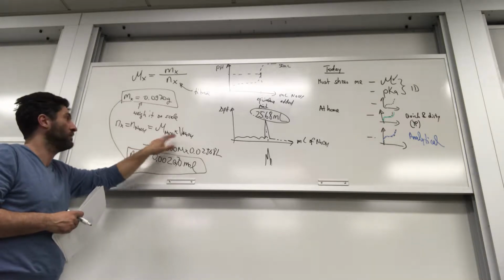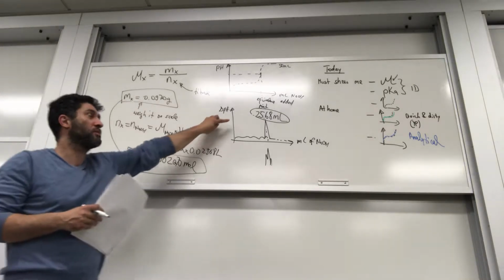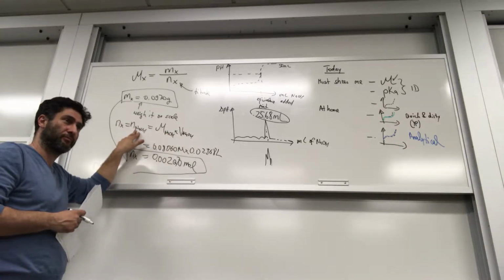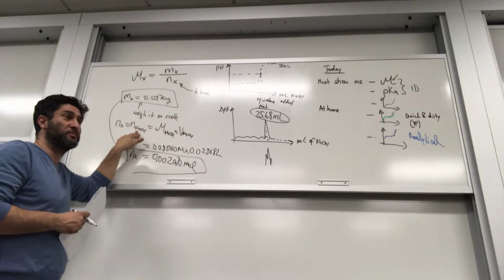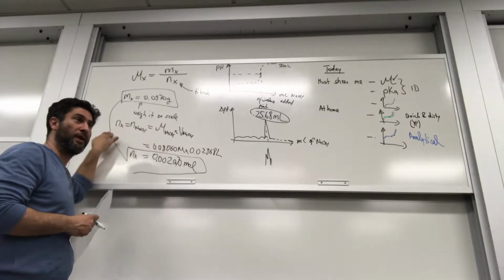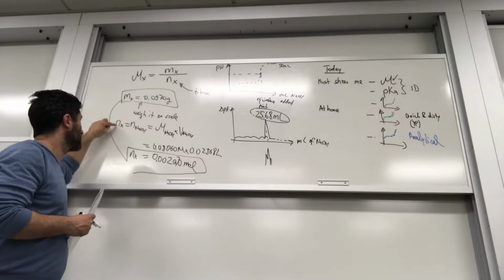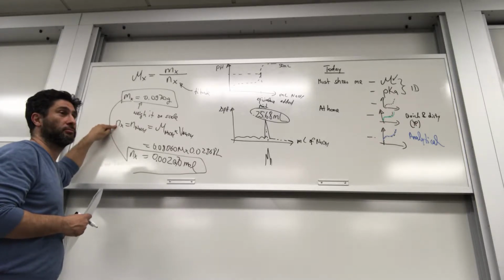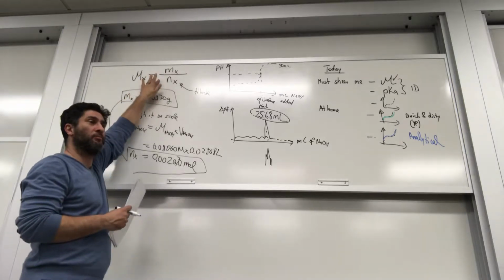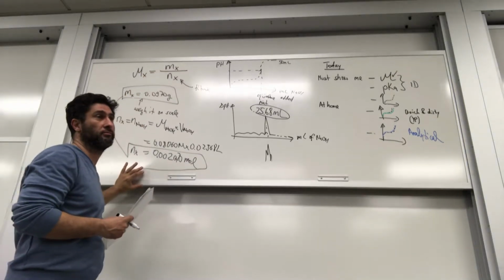You put a label on the bottle. This is what you get from this graph here. These two things together give you the moles of base at the equivalence point. But at the equivalence point, because it's a 1-to-1 ratio of acid to base, it's equal to the moles of acid. By definition, mass of acid divided by moles of acid is the molar mass.